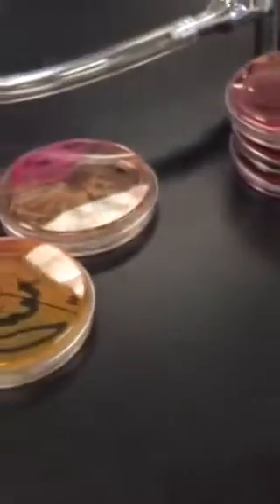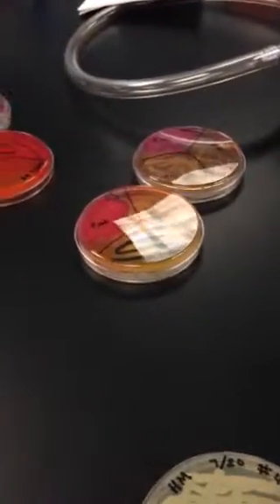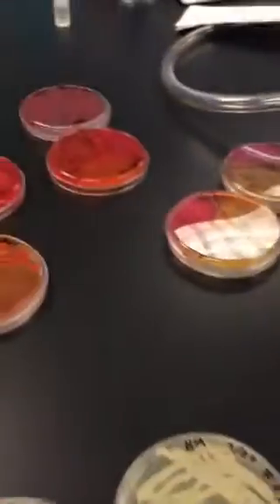So, in summary, on your MacConkey agar, only gram-negative enterics will grow. And when I say enterics, in this case, I mean Enterobacteriaceae, because you do have enteric Enterococcus. That's a different division, a different section. So here when I say enterics, I'm specifically referring to Enterobacteriaceae.